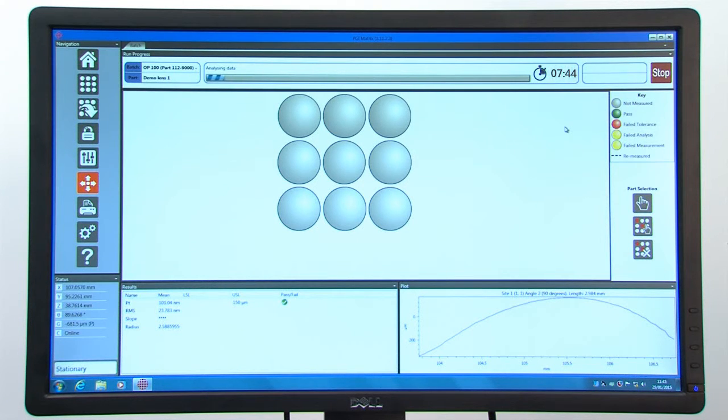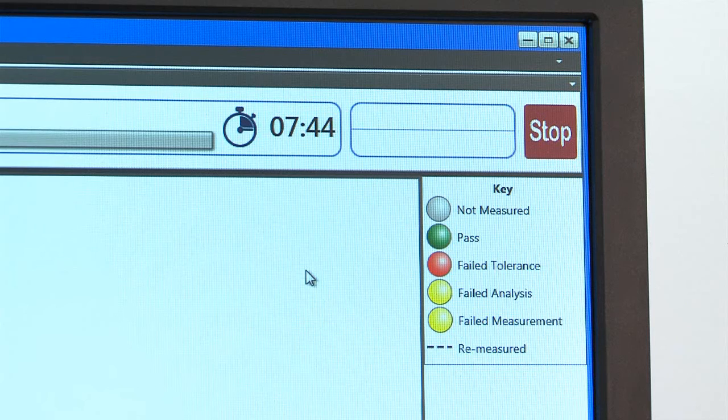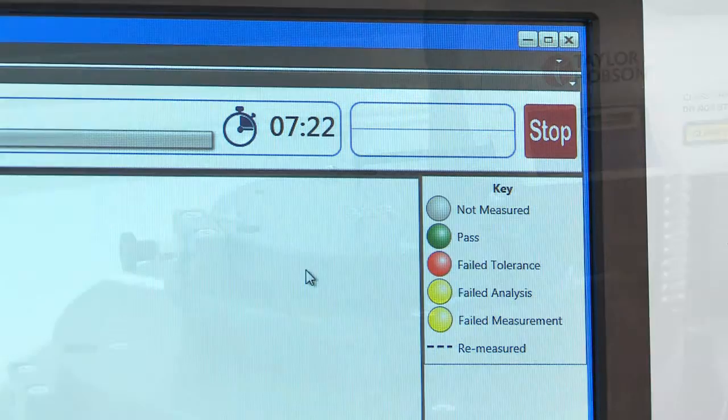Each part will indicate a pass or fail condition in real time, to quickly alert users of yield and a measured time indicator gives cycle time remaining.